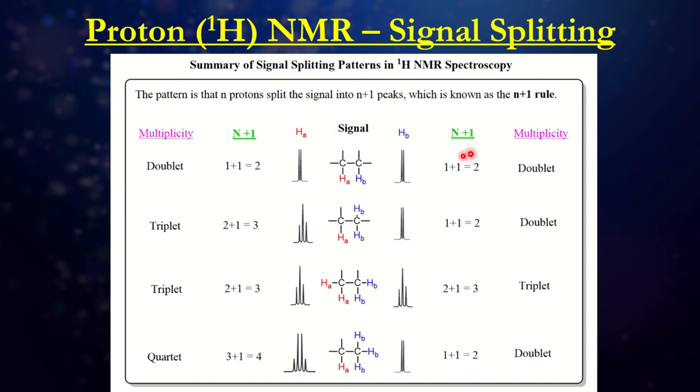So these are all the different types that you will see. So the pattern we see is called the N+1 peak rule. That's what we call it. And you can sort of see the difference in the peaks. So if we get the two peaks here, that represents that there must be an adjacent hydrogen to the hydrogen that we have in the adjacent carbons. So you can always use this as reference in terms of analyzing the graphs here.